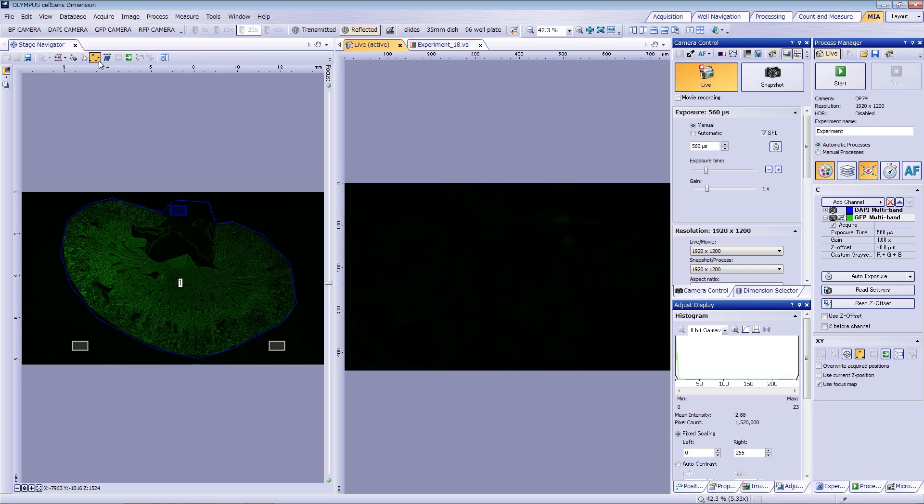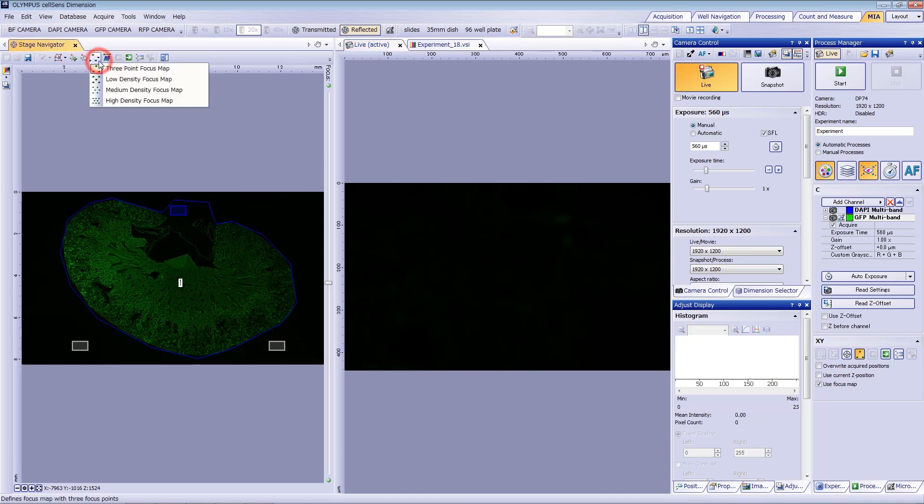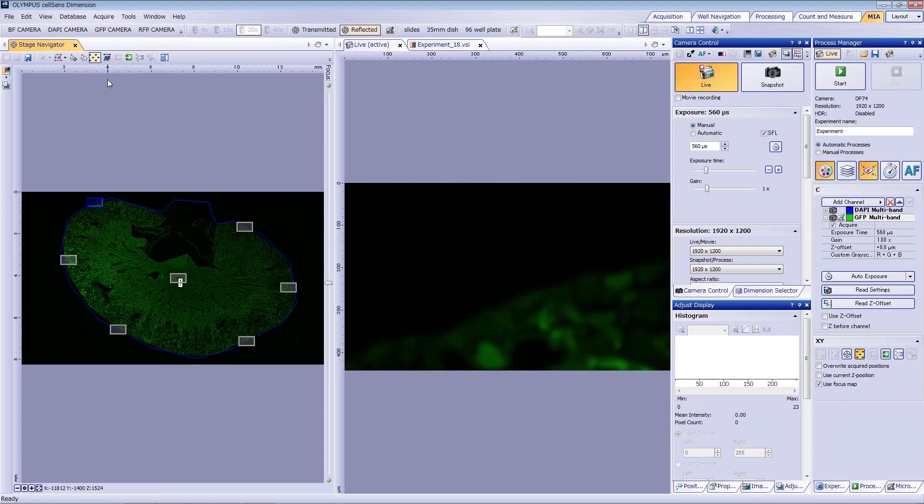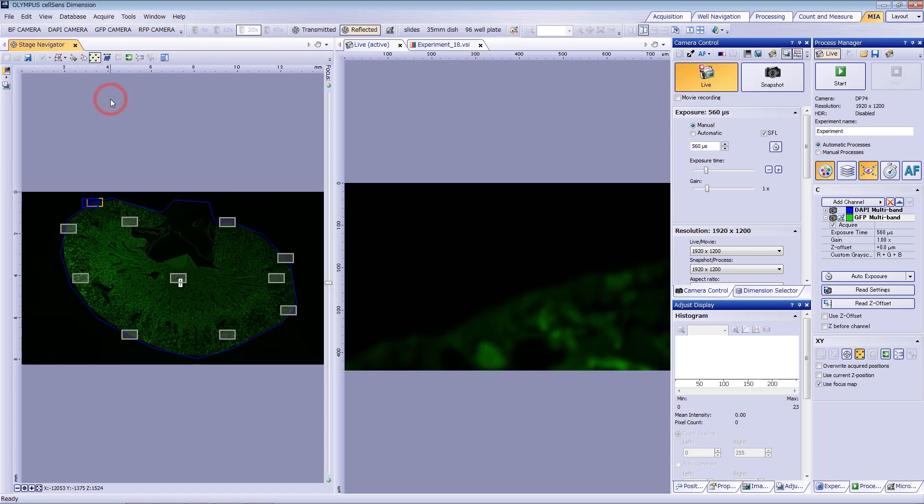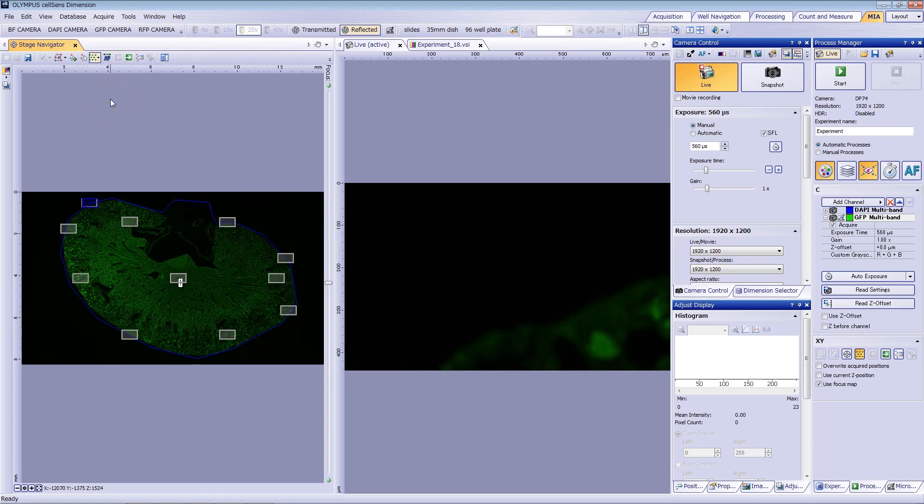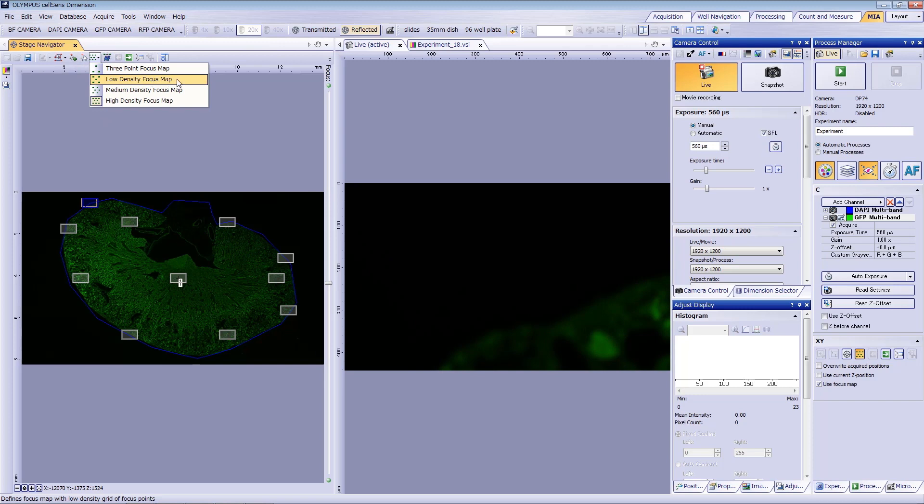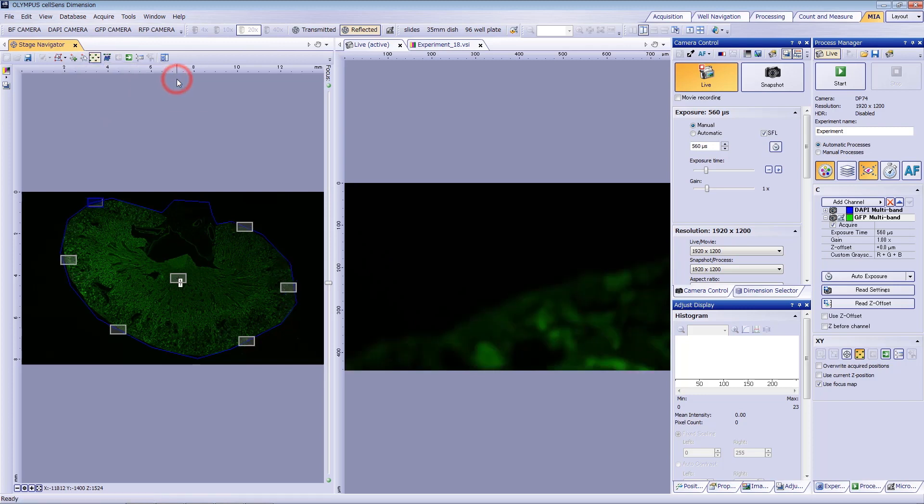A three-point focus map will automatically position three points on the stage overview image as focus points. You can also select low, medium, and high-density focus maps to automatically place more focus points within your focus map. Here, we'll register the best focus position using a low-density focus map.